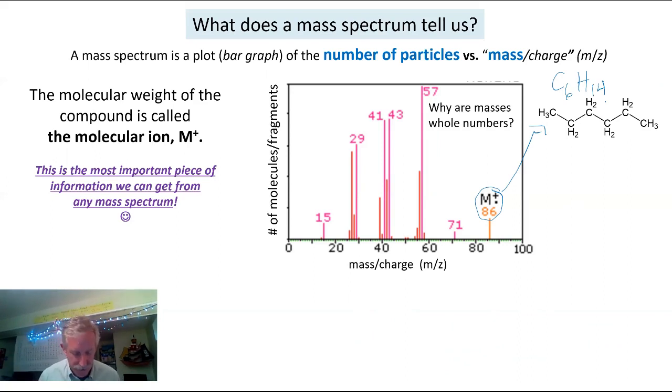Here is why. Mass spec is Abby from NCIS's favorite instrument because it is actually measuring the mass of every molecule, one molecule at a time. This molecule, how much does this one weigh? This molecule, how much does this one weigh? Every single molecule that is injected into the instrument gets measured.